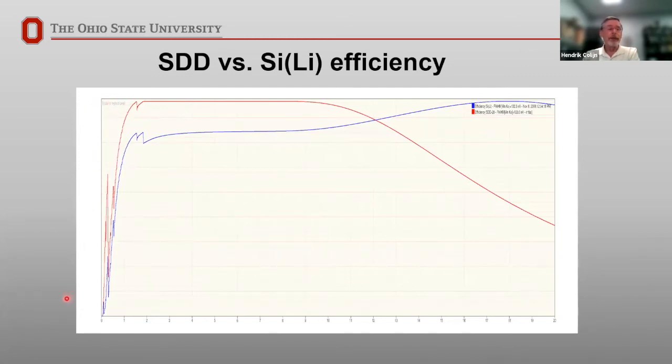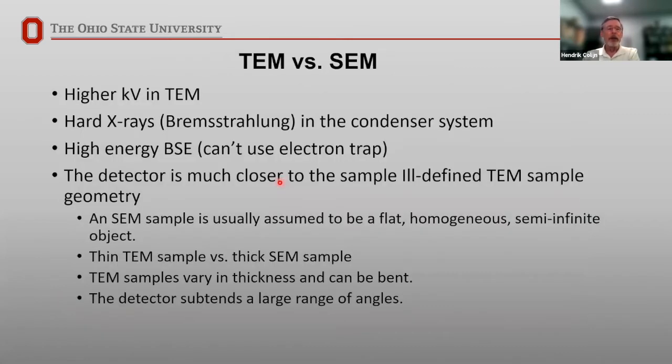It also depends on the kind of window that you have in your system, since the window will also absorb particularly these low energy X-rays. So this is all pretty much common between TEM or STEM and SEMs.